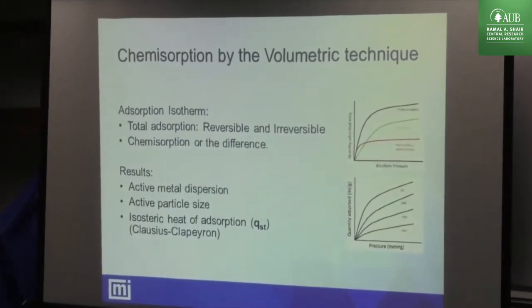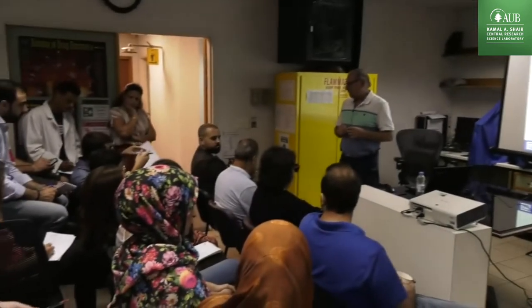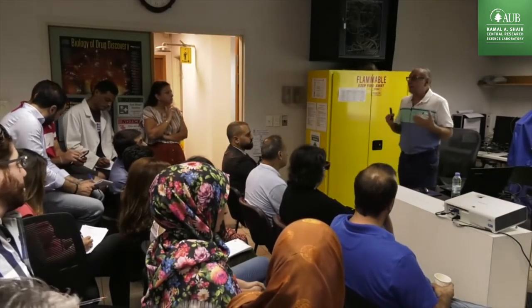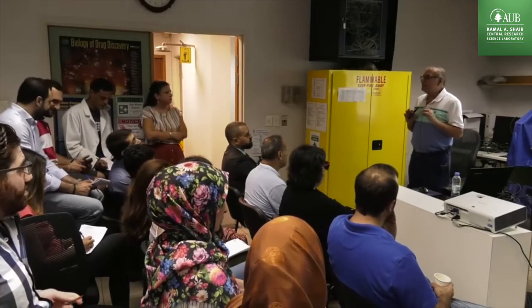When you are talking about the surface dispersion of the surface, in case we have zeolite that has cavities, like internal surface, is it measured? Of course. Everything accessible. This is why the keyword is accessible. Everything accessible to the reactant.